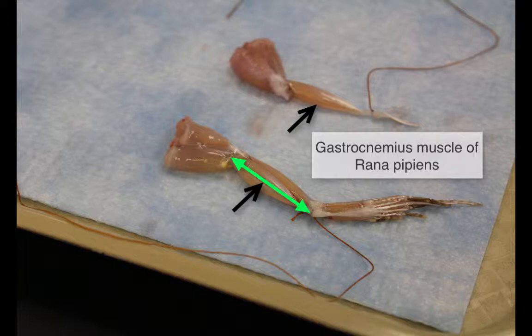This is the preparation of the gastrocnemius muscle. The green arrow shows the in vivo resting length measurement, and the thread is tied to the Achilles tendon.